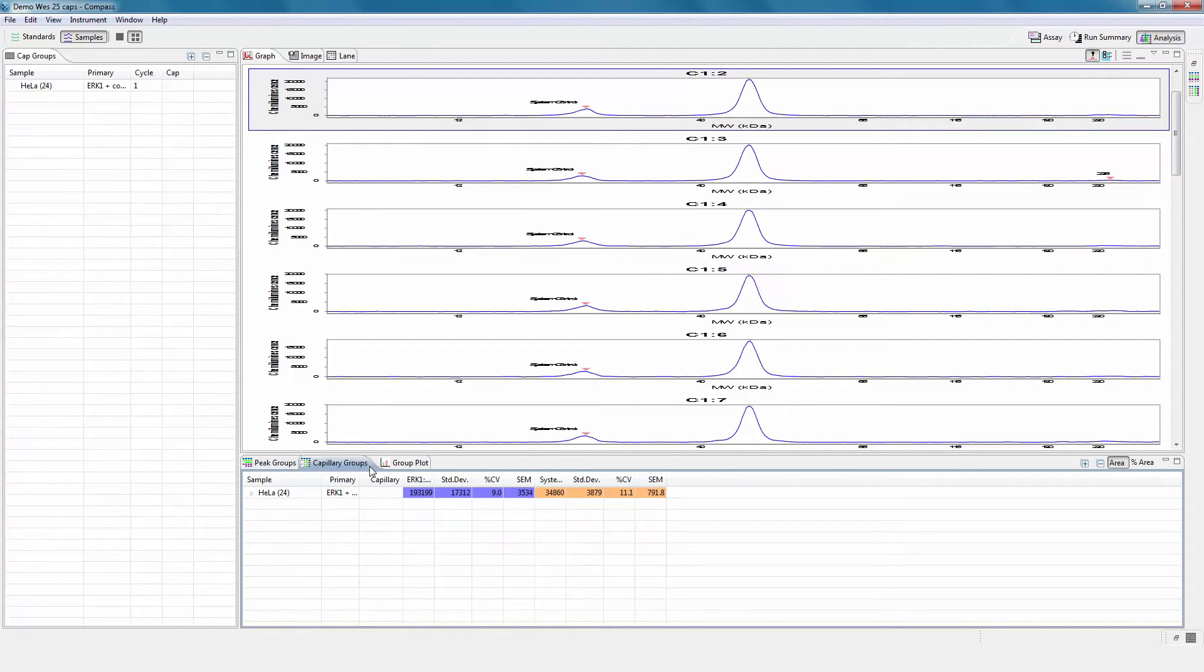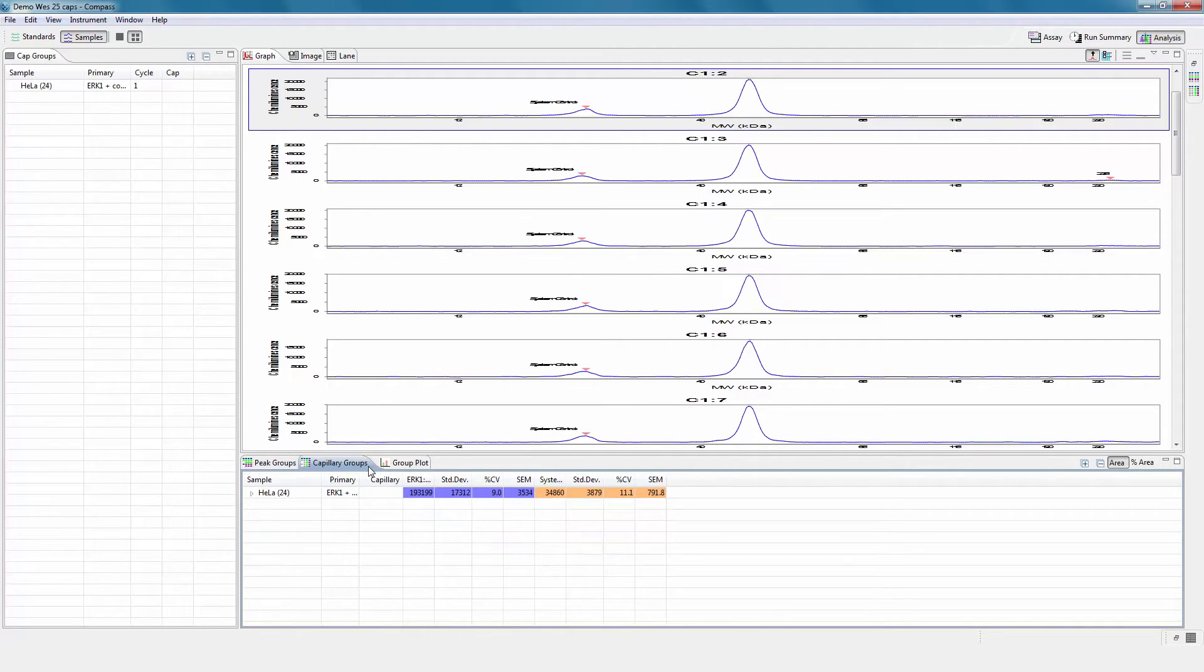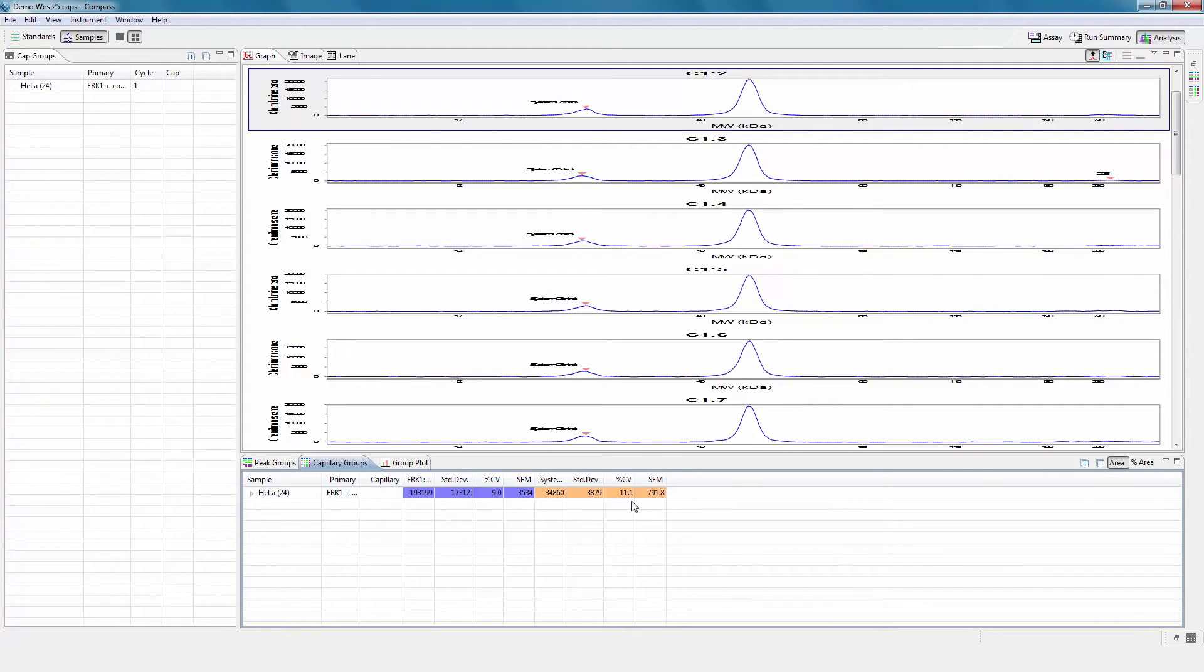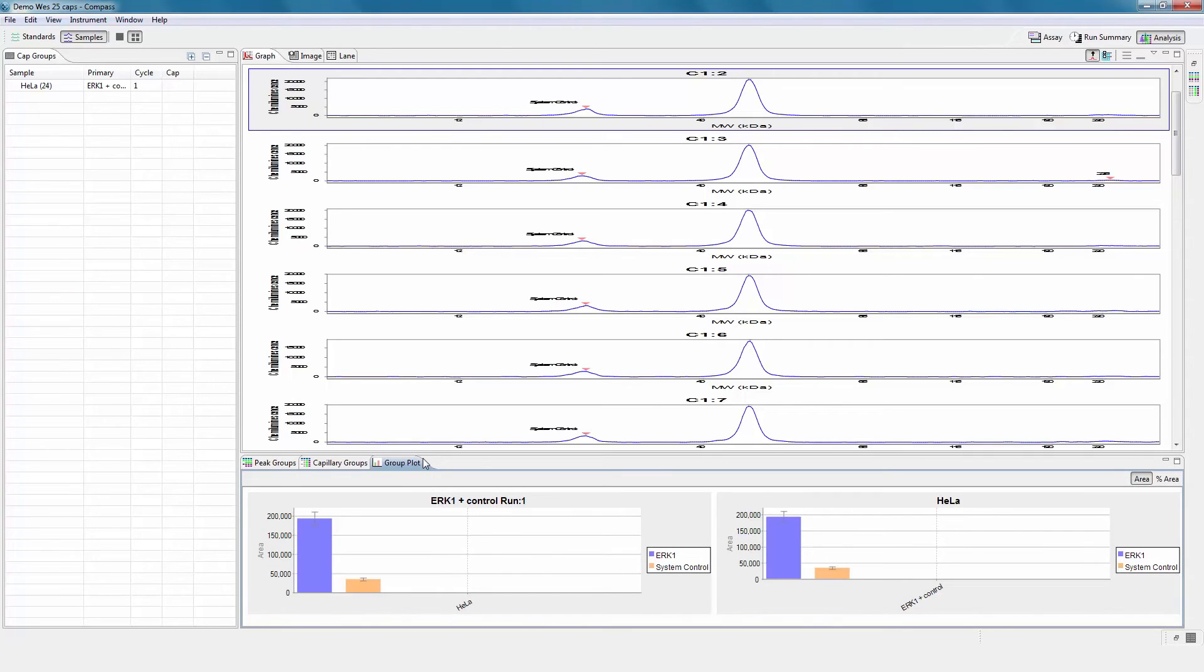The capillary groups window pivots the peak groups results to show statistics for named peak proteins in individual columns. The mean values for named peaks in each group are plotted in bar graphs with error bars showing the standard deviation.